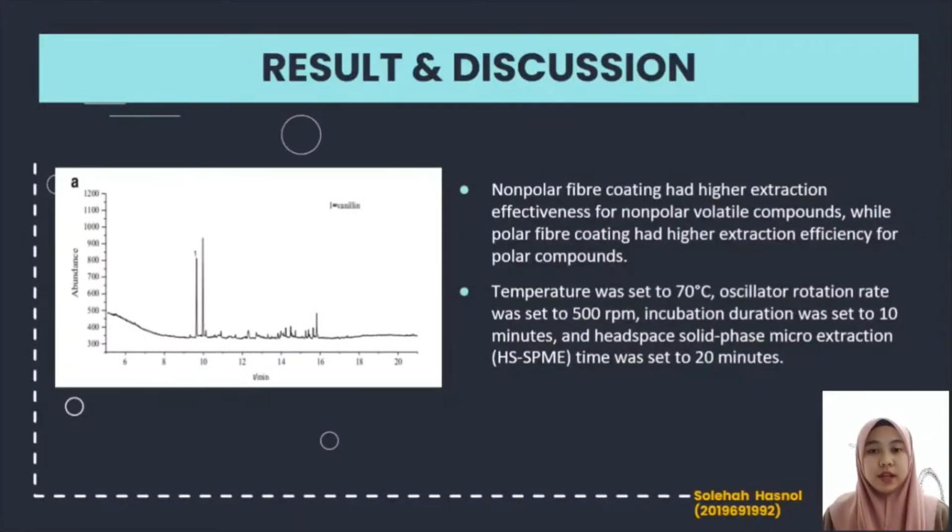Assalamualaikum. My name is Soleha binti Asnul. I want to present about result and discussion by gas chromatography. In this graph, according to the law of comparable mutual solubility, non-polar fiber coating had higher extraction effectiveness for non-polar volatile compounds, while polar fiber coating had higher extraction efficiency for polar compounds.